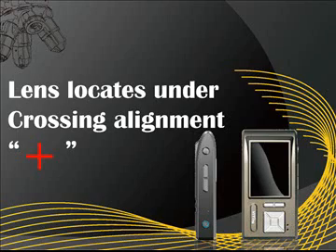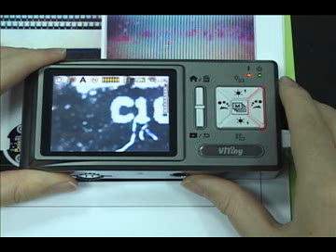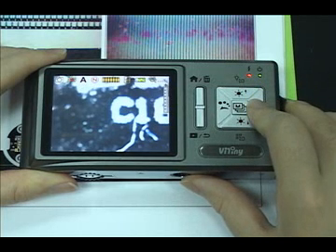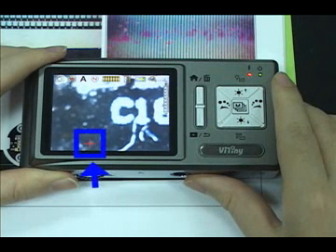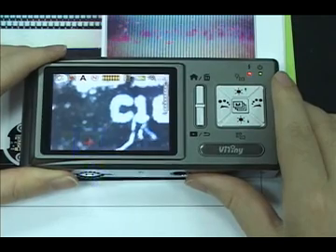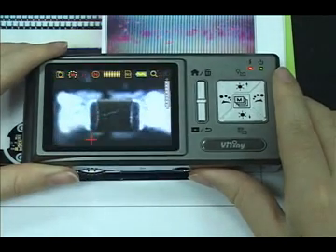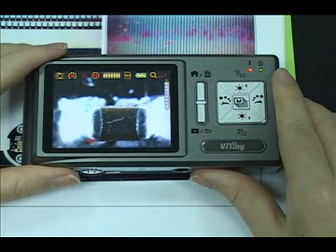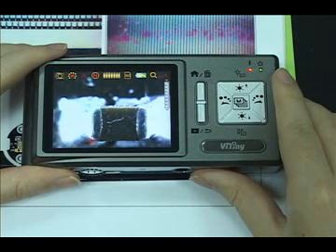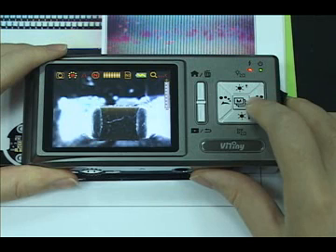The lens is located under the crossing alignment. Press and hold the right button to display the crossing alignment sign. Use it to show the position where the lens of the machine is located, making alignment more convenient during observation. Press it again to hide the sign.